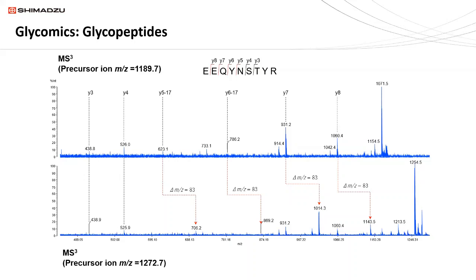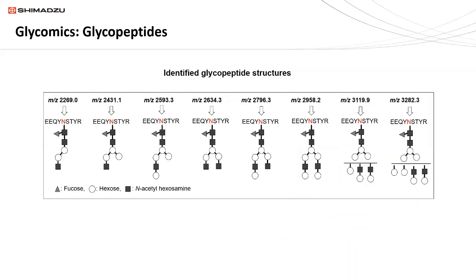And then in addition to identifying one of the oligosaccharides, we also were able to follow the same exact method and analyze 8 different ones and be able to determine their structure. So this is a very powerful tool in order to look at these individual oligosaccharides, which are actually rather important because, as you know, oligosaccharides are post-translational modifications that are put onto proteins, and they regulate the protein's function.